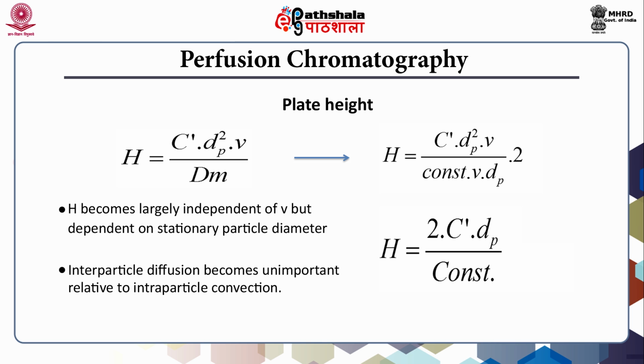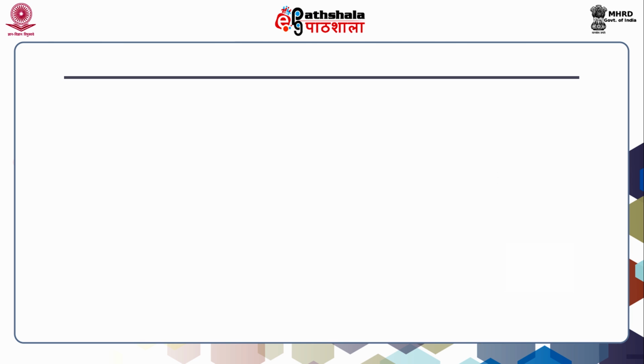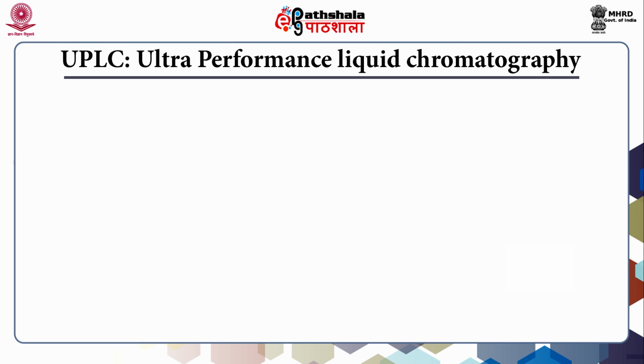resolution. So, coming to the next slide, we will discuss another alternative to HPLC, that is UPLC. UPLC is called ultra performance liquid chromatography.